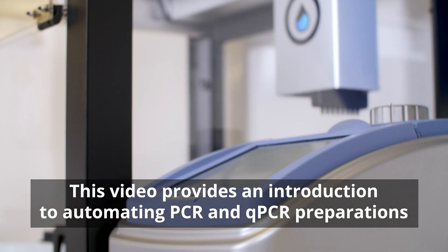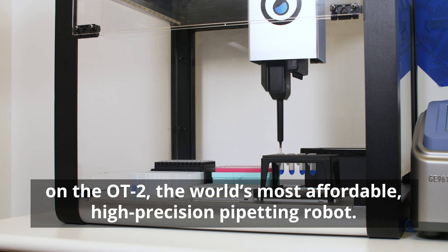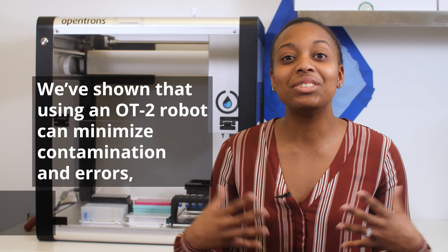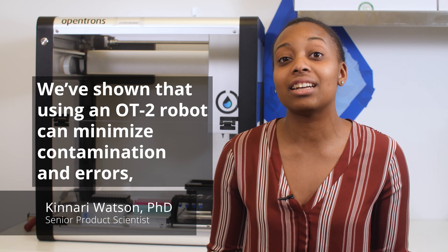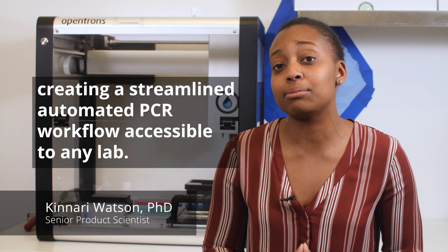This video provides an introduction to automating PCR and qPCR preparations on the OT2, the world's most affordable, high-precision pipetting robot. We've shown that using an OT2 robot can minimize contamination and errors, creating a streamlined, automated PCR workflow accessible to any lab.